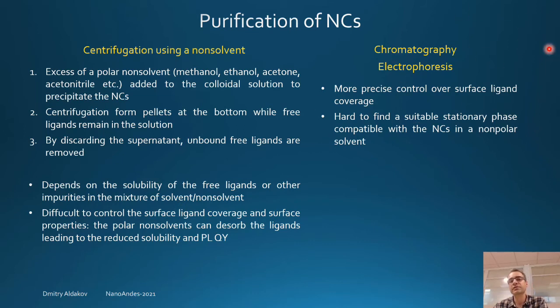So there are some alternative purification strategies, such as chromatography or electrophoresis. Like this, you don't perturb the ligand shell that much, but it's harder to find the stationary phase to pass the nanocrystals through in a non-polar solvent. So, as usual, you have some advantages and disadvantages.